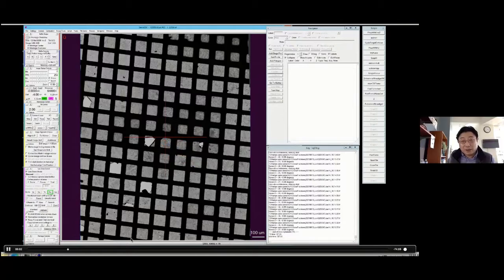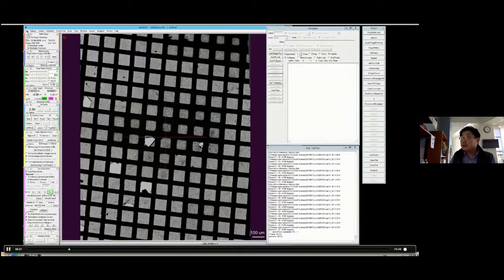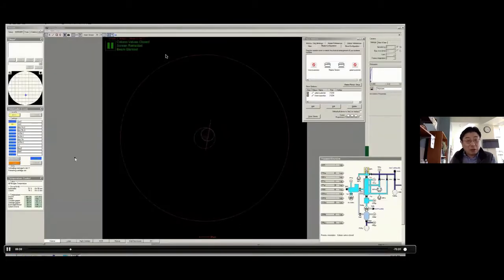Oh, there are two things to speed up. One is we don't do pre-tracking, because typically we need to do pre-tracking, and so I can answer this one, but right now I want to tell you things right here on the screen. So this is basically a different mode from view focus. So we want to set up the, okay, this is kind of too quick now. But because the Titan is very expensive, as you all know, you have to. But this is why I pre-recorded. So hopefully you can do it yourself, watching it yourself.